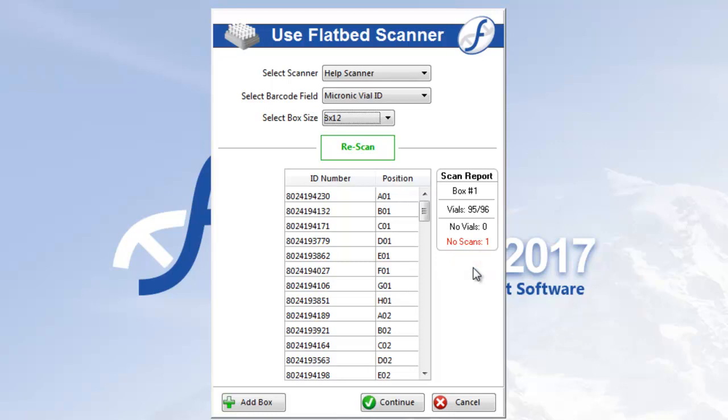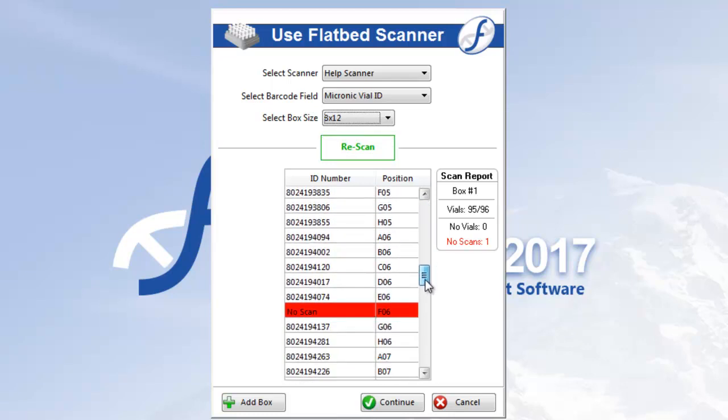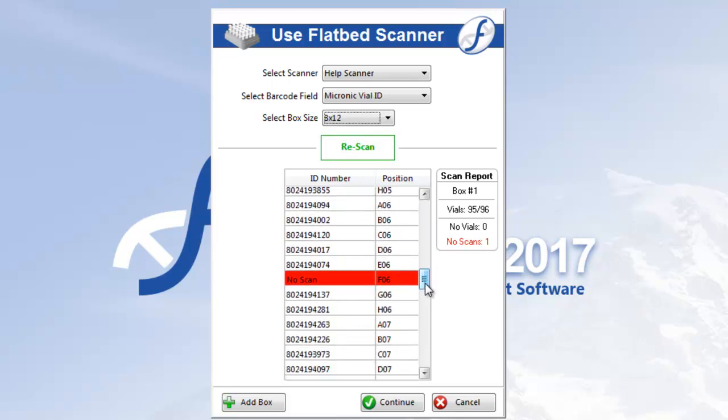You will have to clear any no scans before you can continue your work, but no vials are okay. You can either click Rescan to do it all over again or manually fix the problems by scrolling through the list to find the ones highlighted in red. These are the no scans. No vials are in yellow.